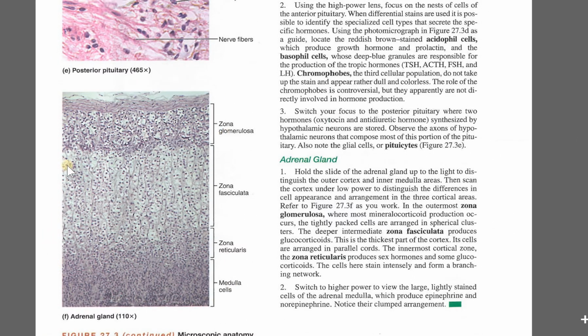All right. Now, keep in mind the adrenal gland has two layers to it. The outside most layer to the adrenals is called the adrenal cortex, and the inside most layer is called the adrenal medulla. Okay. And so collectively you see all the different layers here to the adrenal gland. Okay, now grab another blank sheet of paper. We're going to draw some adrenal parts out in just a minute.